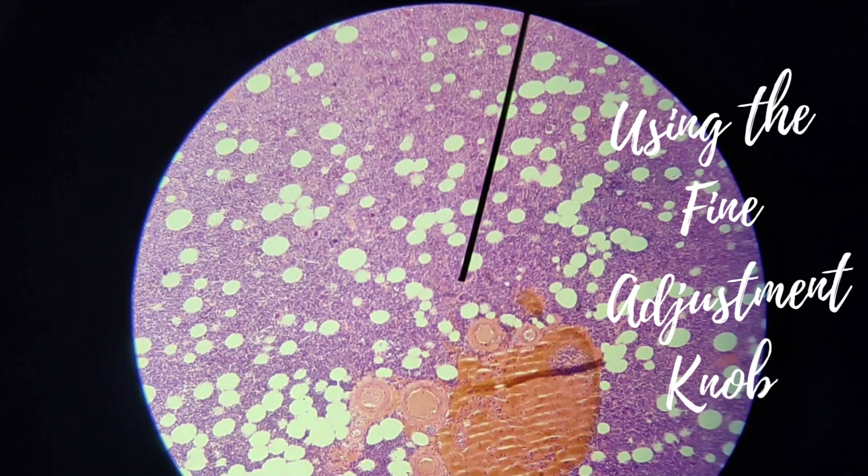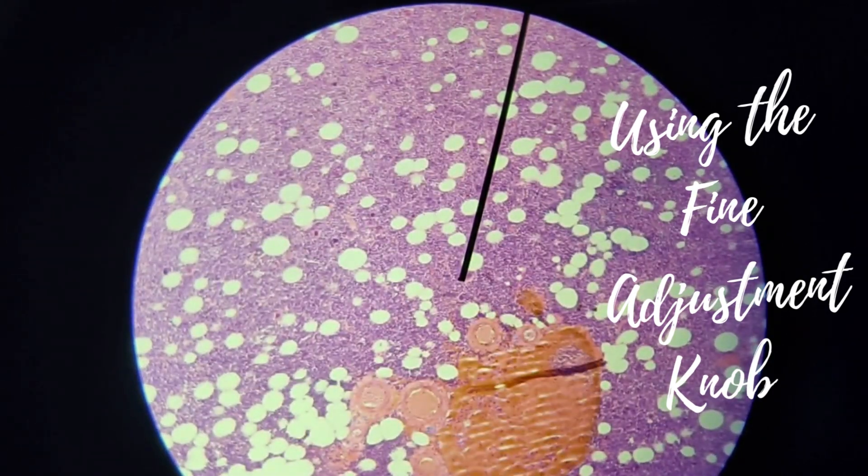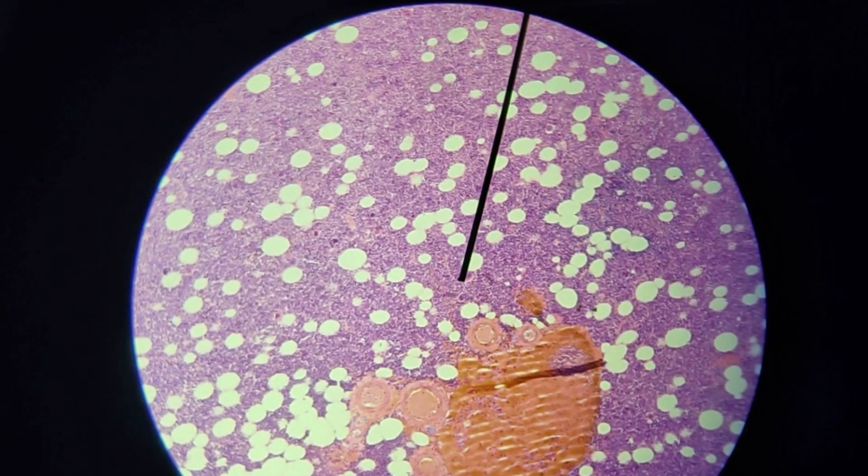You can also use the fine adjustment knob. I'm now using the fine adjustment knob, and I can stop when the image is shown clear.